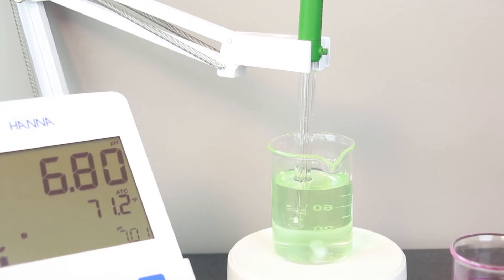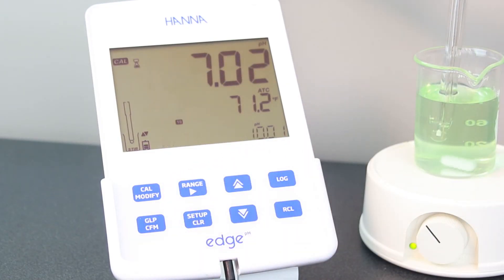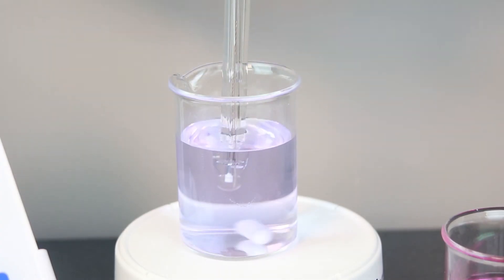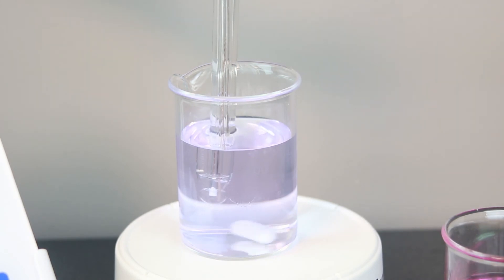Once again, once stable, press confirm. Rinse the electrode again and place it into your pH 10.01 buffer. Once you have calibrated your three points, press the Cal button to save calibration and return to measurement mode.